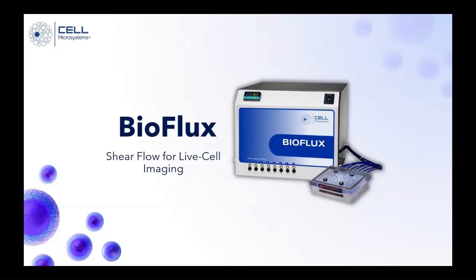Okay. Can the multi-well plates be coated with PDMS or polyacrylamide gels for stiffness related shear flow studies? So the most common plate has a glass cover slip at the bottom, but we do also have custom substrate plates, and some of these do have PDMS at the bottom, so there wouldn't be a need to coat with PDMS.